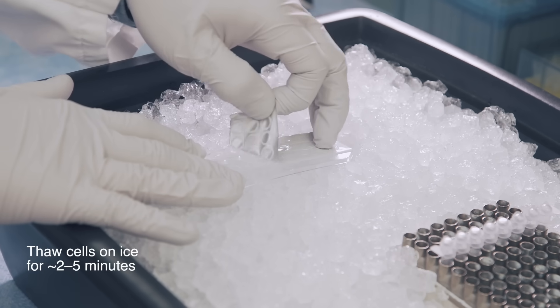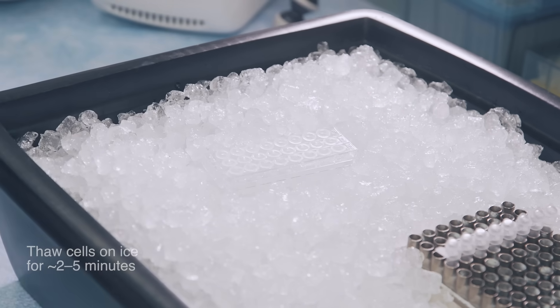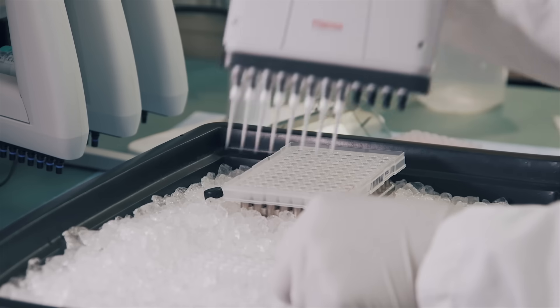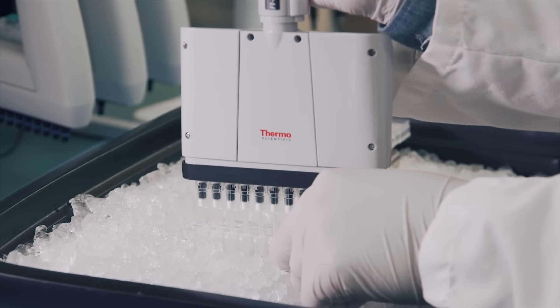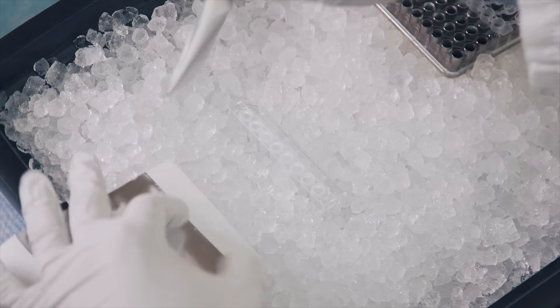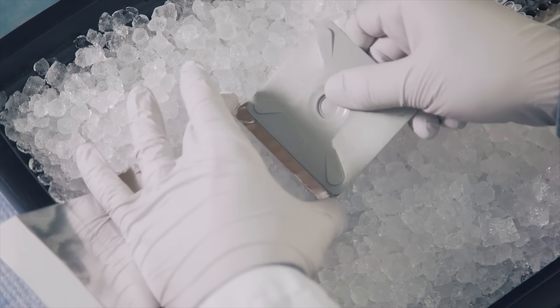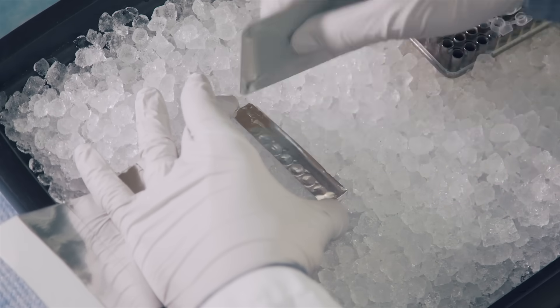Keeping the cells on ice, carefully remove the seal and add DNA to the cells. Thoroughly mix the cells and DNA, and then apply the supplied adhesive foil seal cut to fit the number of strips.